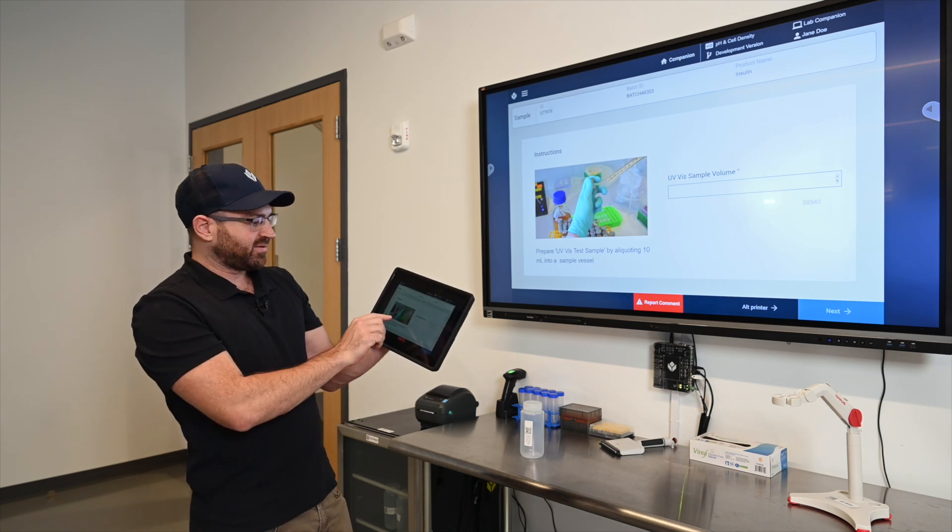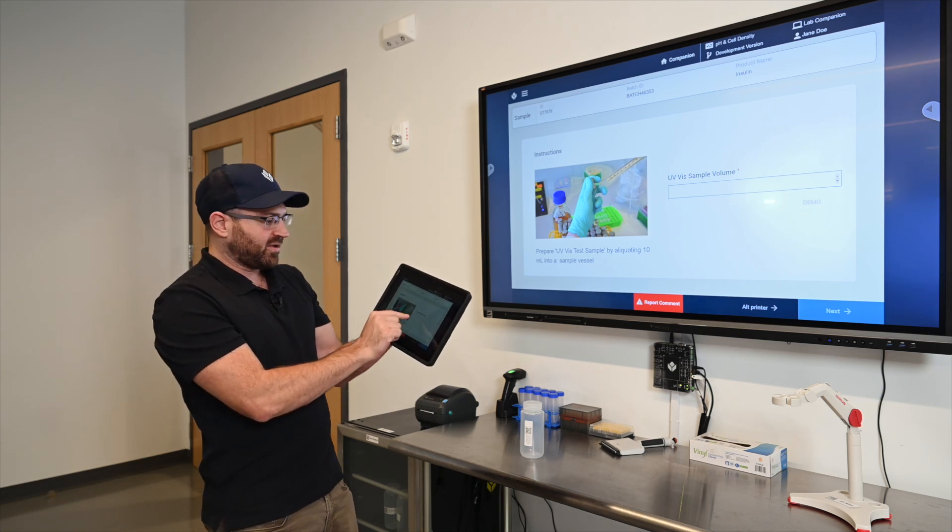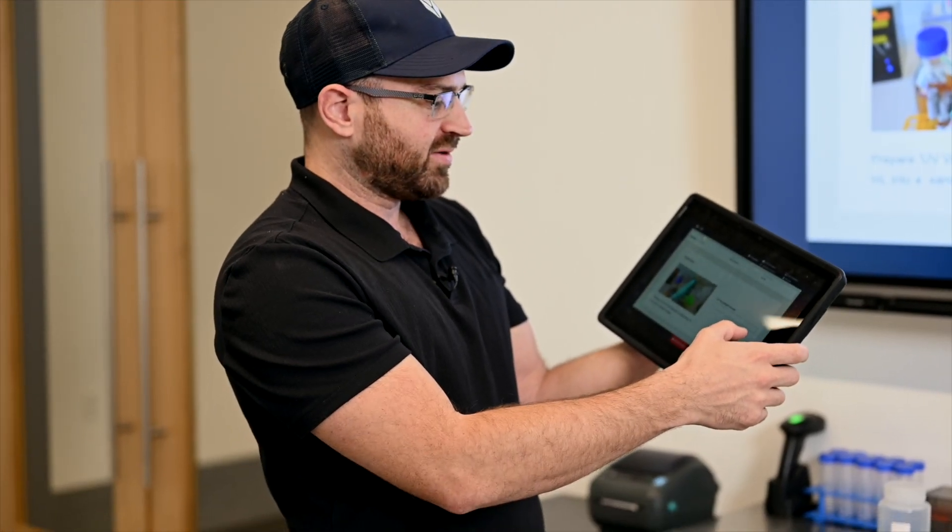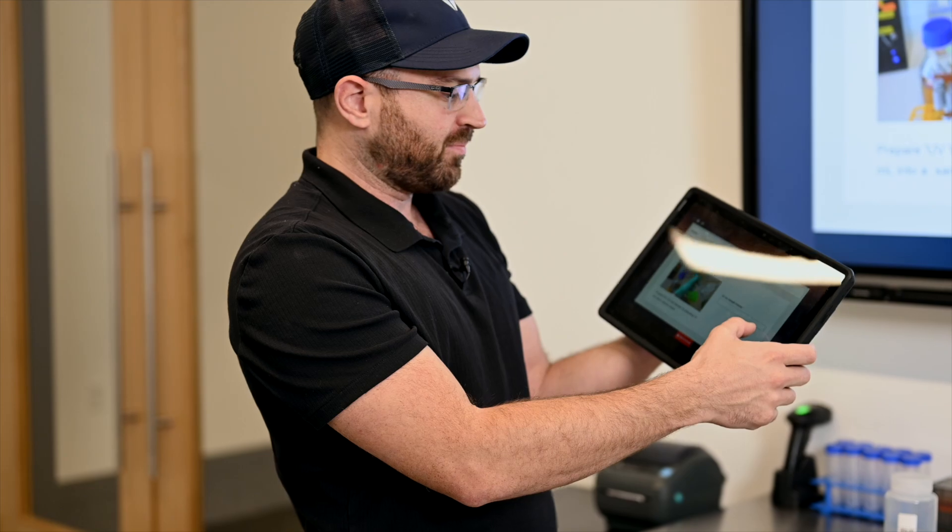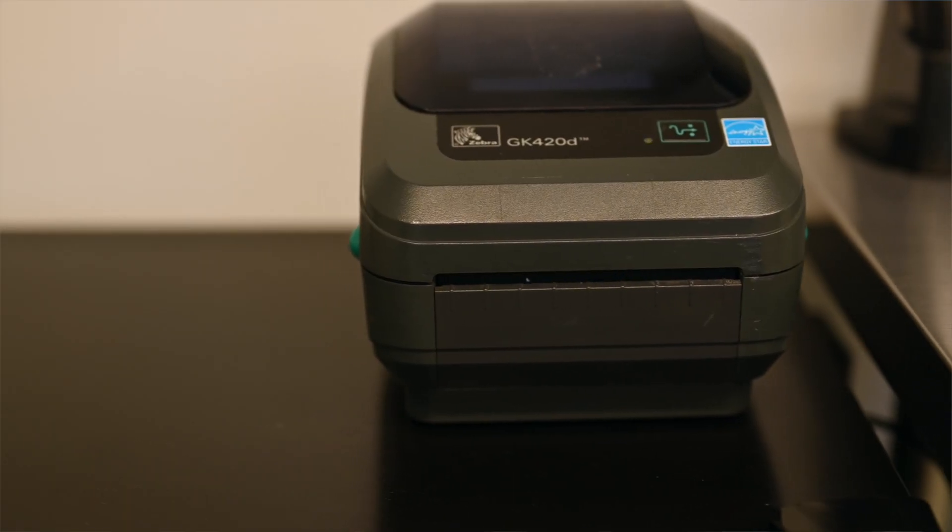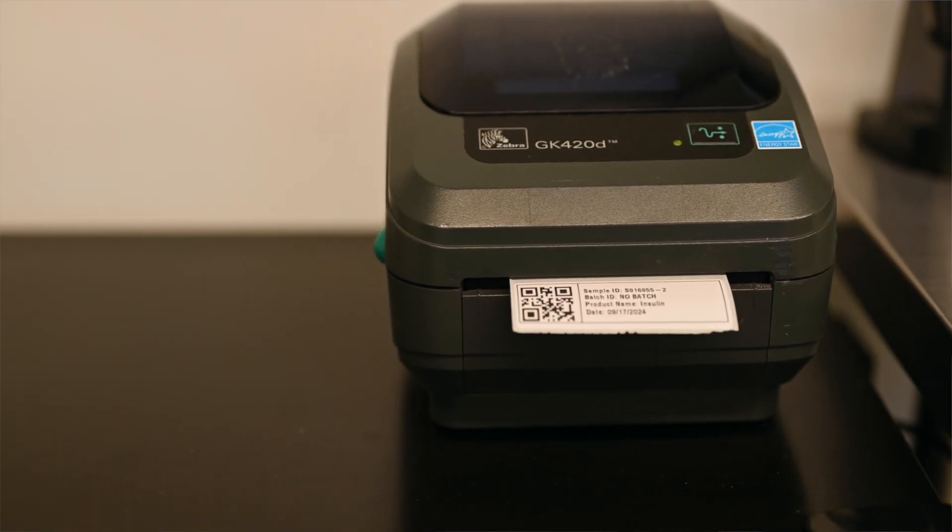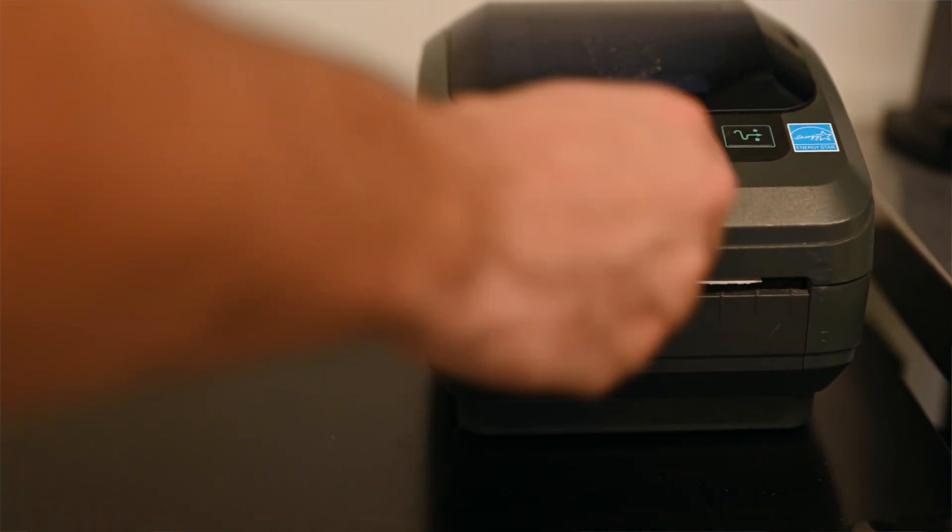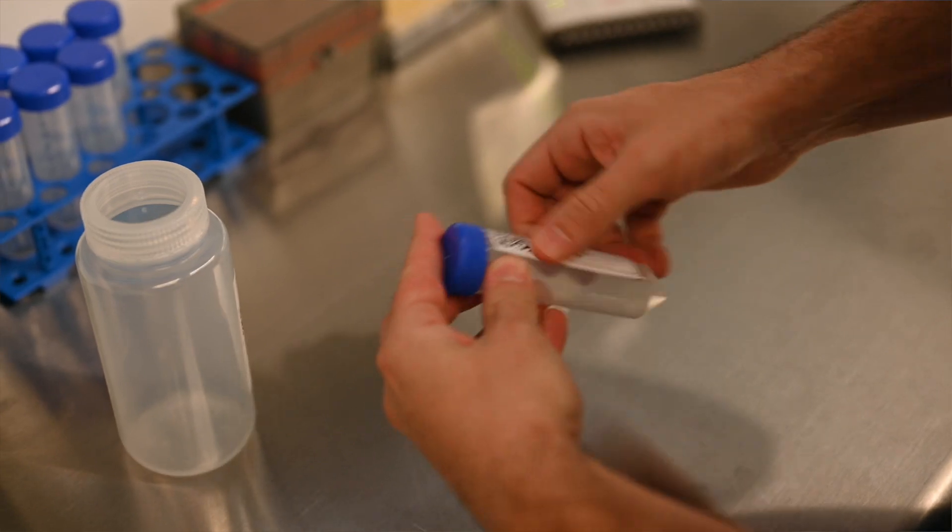This is going to basically create a UV spectrophotometer sample. So I'll press this button for demo purposes to take 10 milliliters and that's going to print out my test sample label.